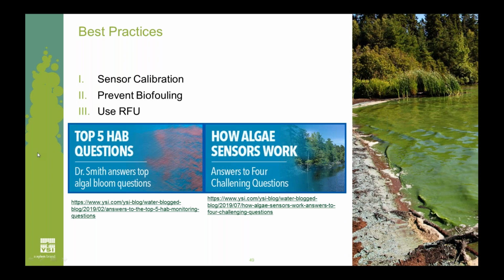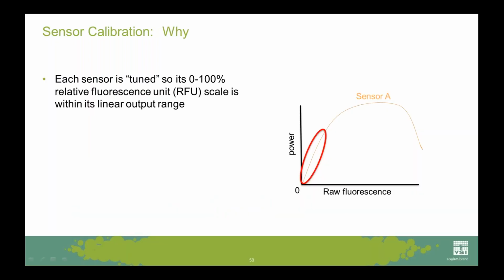I've covered a lot of these topics, and I touch on some of them in a couple of blogs, including one that I wrote last year just after doing this same presentation. Now, the funny thing is that in practice, some of these high-minded principles are rarely the things that trip users up. Rather, it's usually the most fundamental things that we're going to talk about now, including calibration, fouling, and the units of measurement. So let's carry on and talk about calibration.